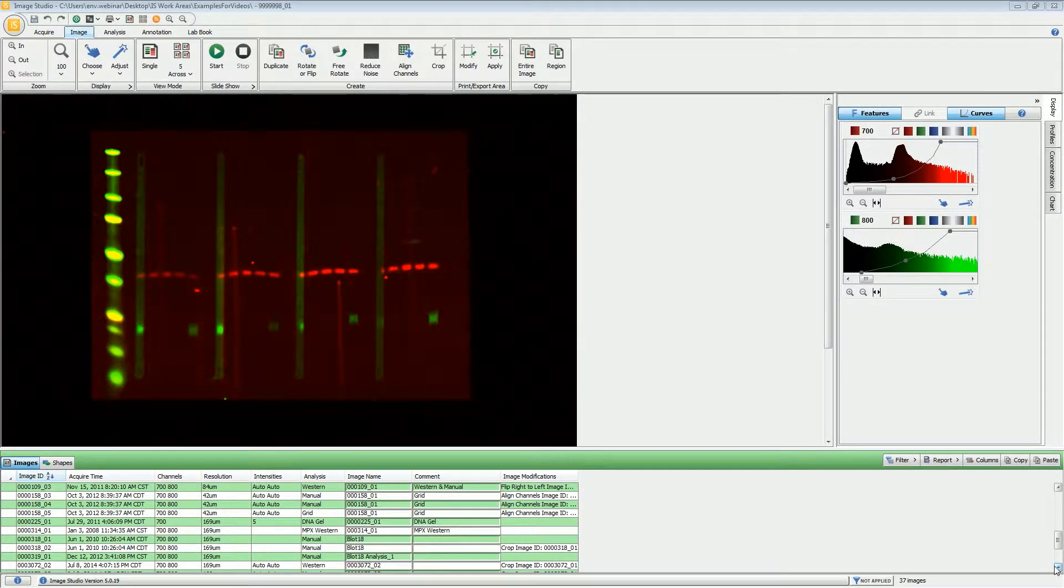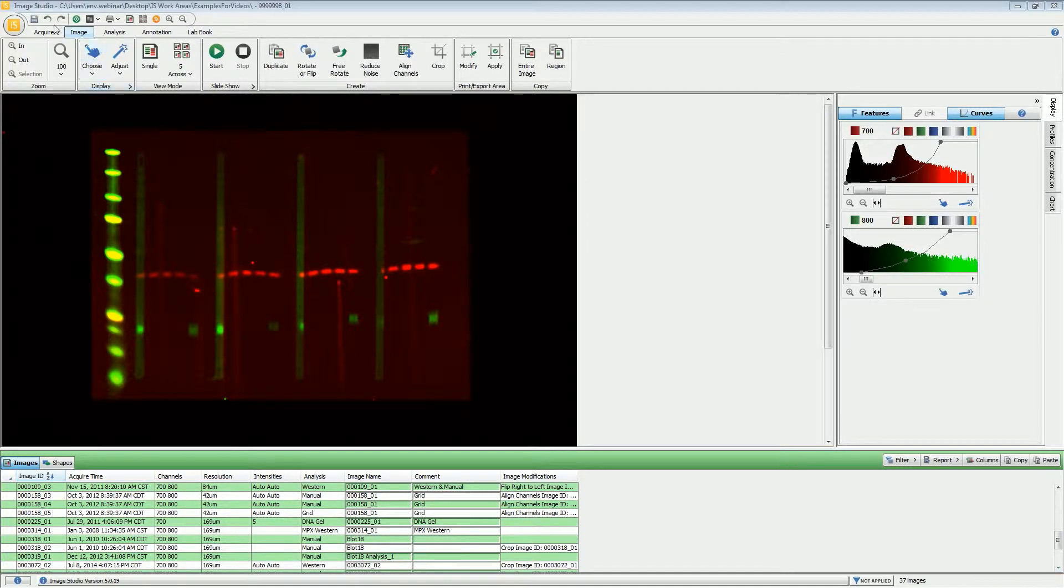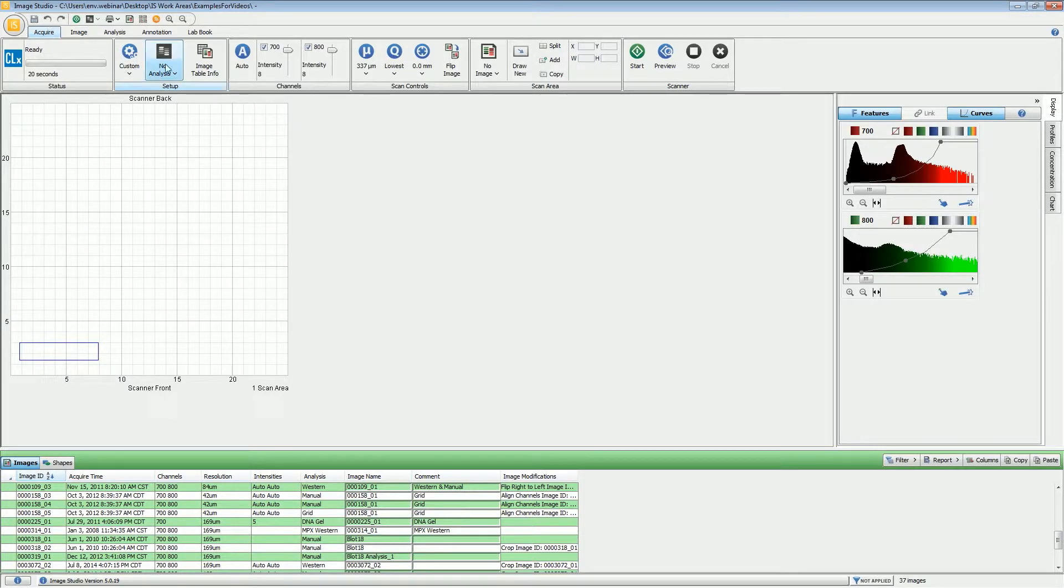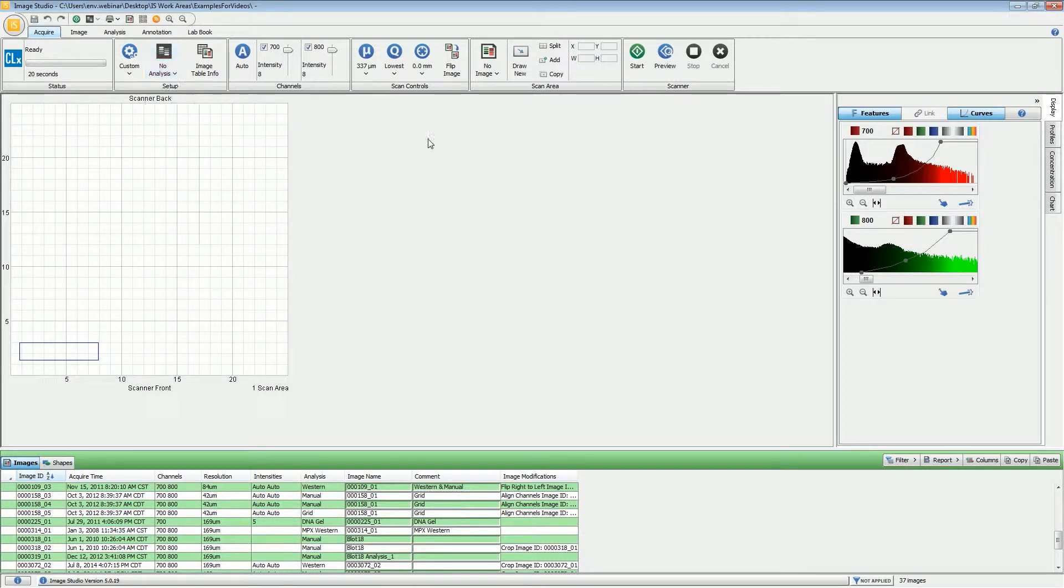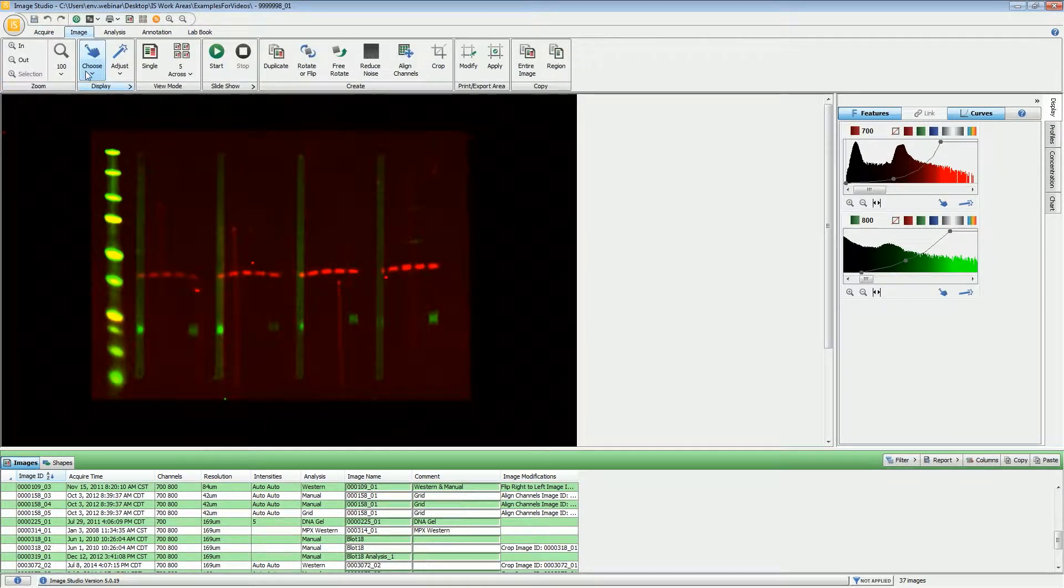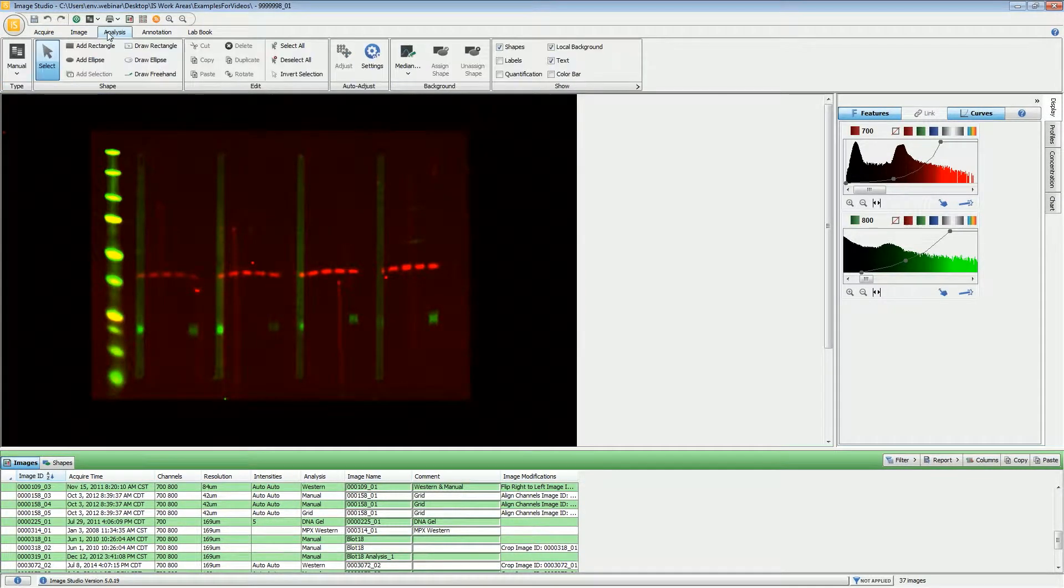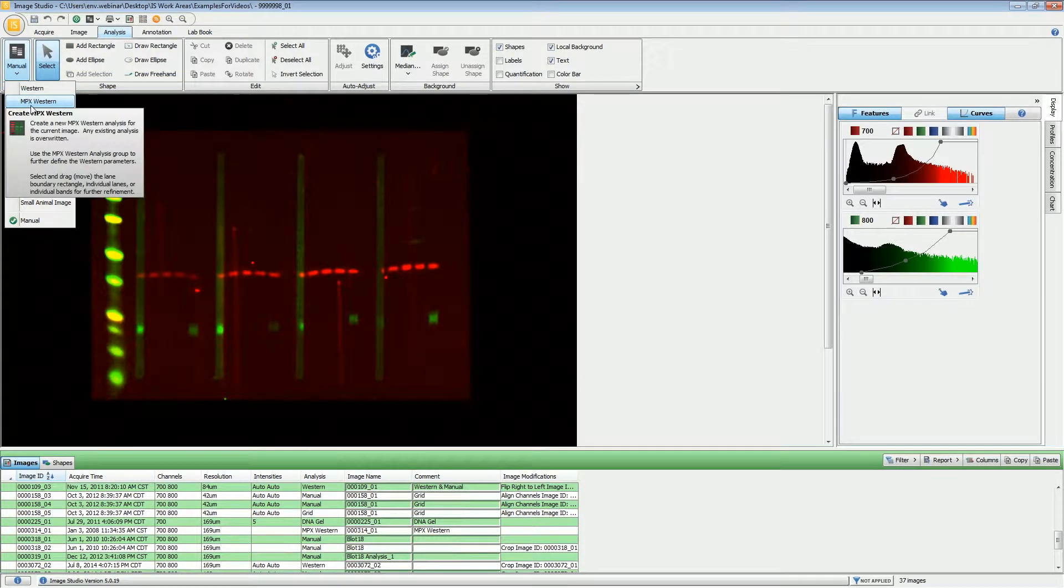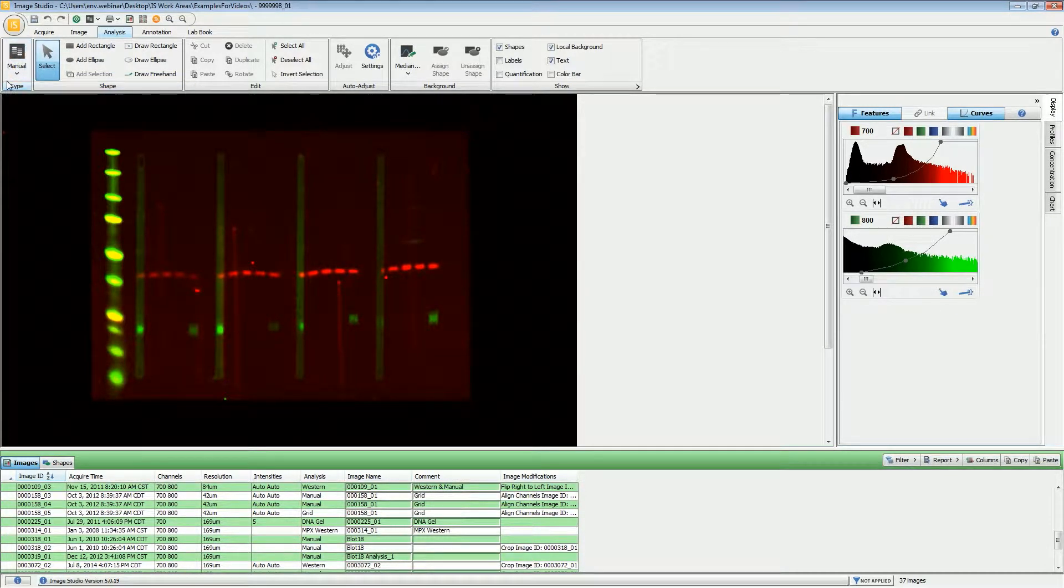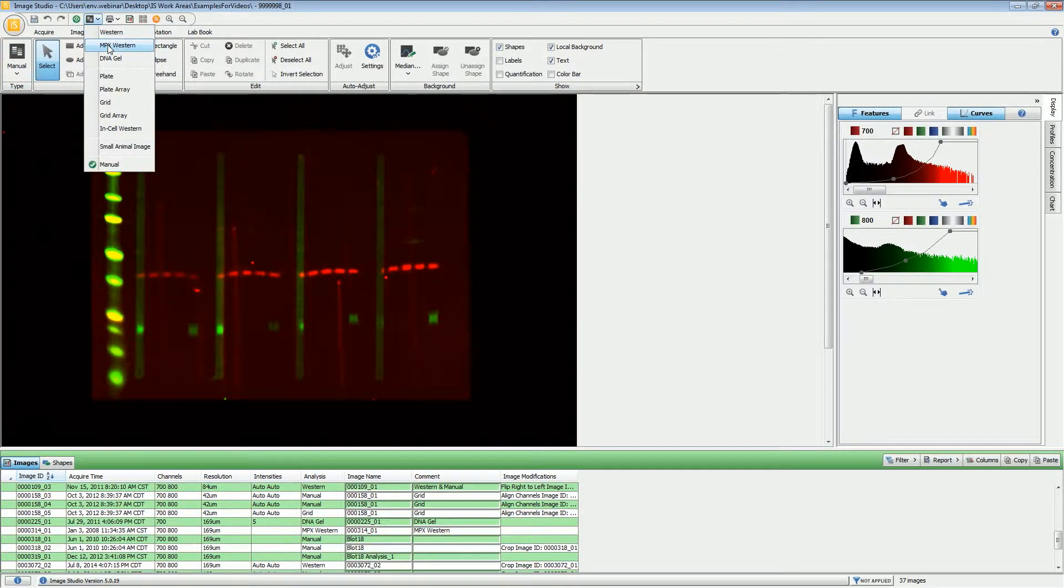In this video, we'll be going over the process of doing an MPX Western analysis. At the beginning of your image acquisition, you can set MPX Western as your analysis type. If you did not do that, you can go into the image afterwards and on the analysis ribbon, set MPX as your analysis type under the type group. You can also access this through the pull-down menu and choose MPX Western.